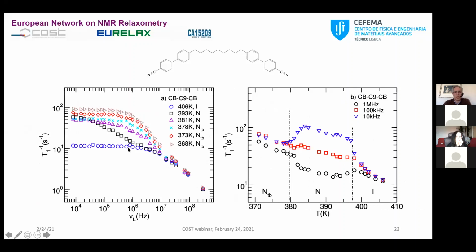Okay, and I would expect, let's say, if I'm increasing the temperature, that my relaxation rate would go down. But that is not the case. That depends on the type of molecular organization that you have there. Therefore, you cannot apply the same mechanism for all temperatures, because it will show some discontinuities in the parameters that you would not be able to describe.